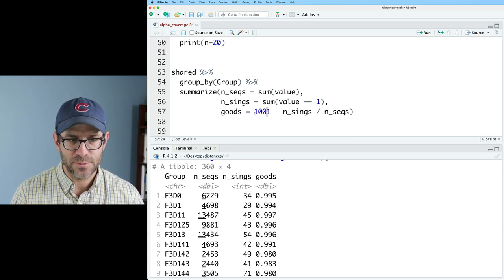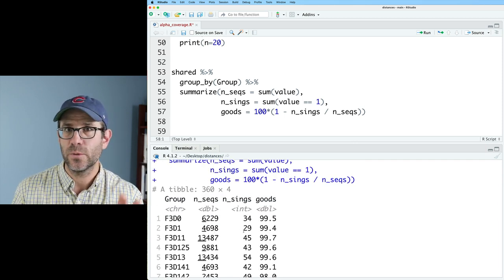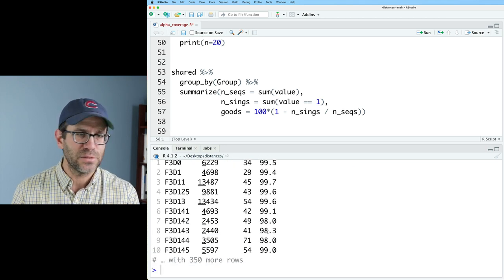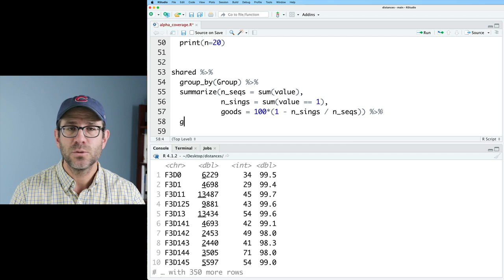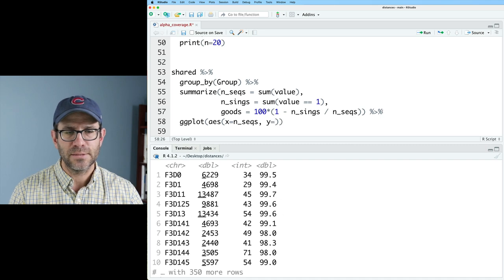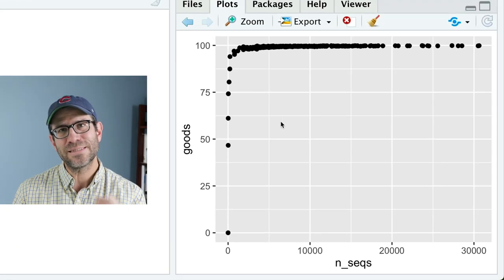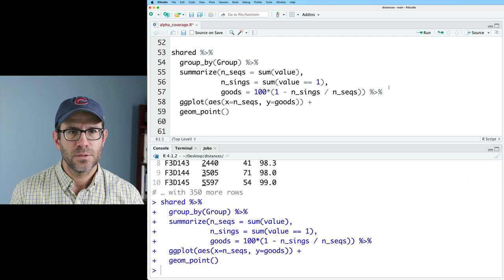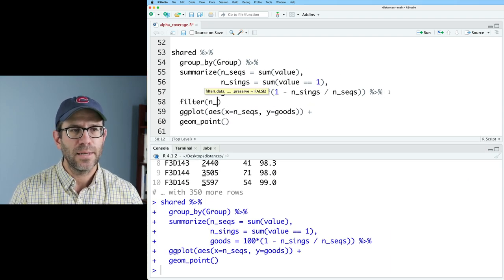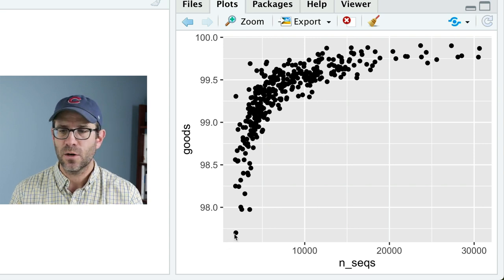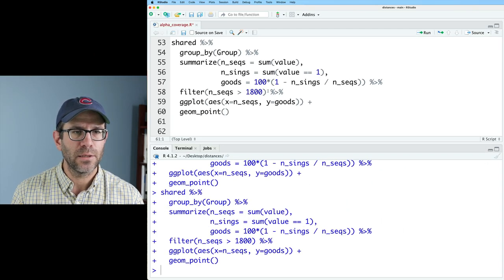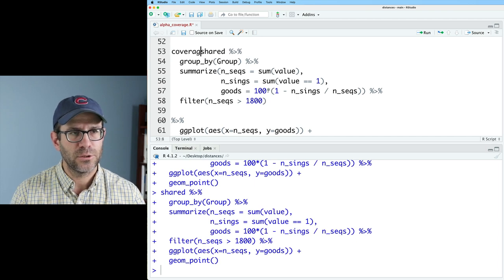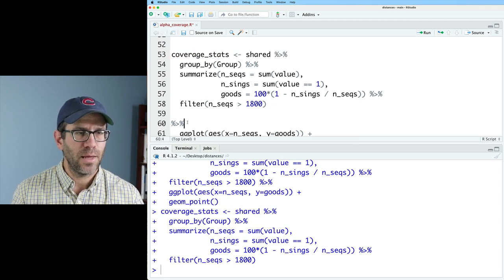We could multiply this by 100 if we wanted. And so now we've got our percent goods coverage, along with our number of sequences and our number of singletons. And look at these first 10 values, they're all above 98%. So that's a really good coverage value. Now let's go ahead and plot this. So we'll do ggplot, AES, x on the x-axis, I'm going to put the number of seqs, on the y-axis, I'll put goods, and then we'll do geom point. And so we can see this kind of hockey stick-shaped curve. And so I think we've decided that we're going to go to 1800 sequences. So let's come back here after our summarize and do filter nseqs greater than 1800.